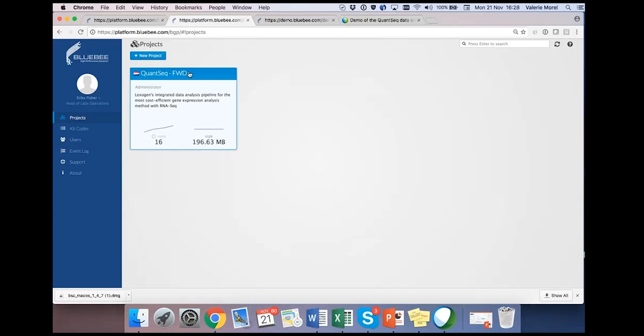You can select for these species, but you cannot change the parameter for HTSeq count or something like that. Of course, you can add a new species anytime there's the need for it.